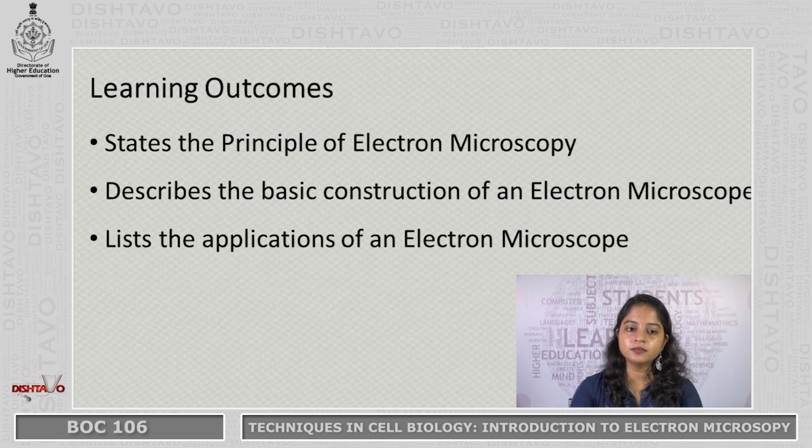The learning outcomes: the student will be able to state the principle of electron microscopy, describe the basic construction of an electron microscope, and list the applications of an electron microscope.